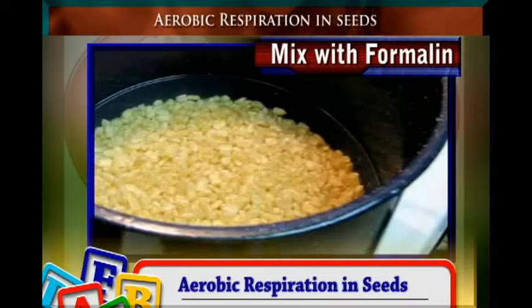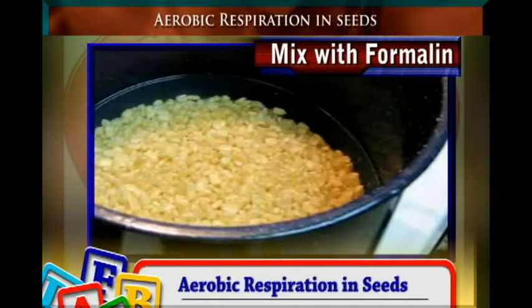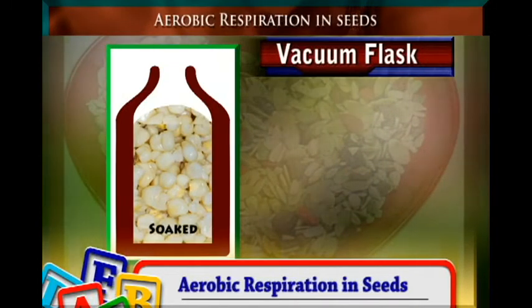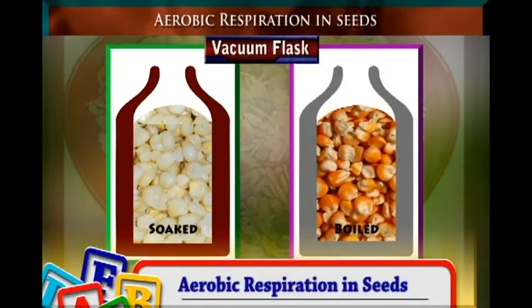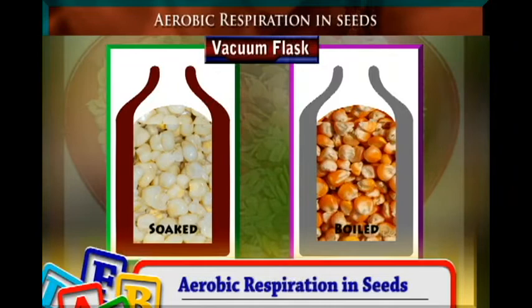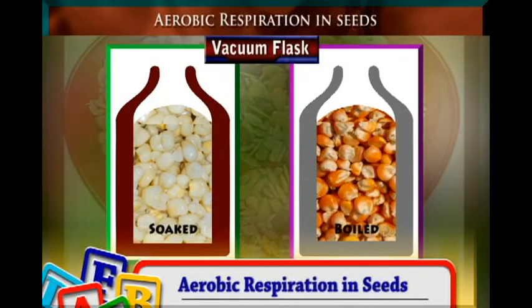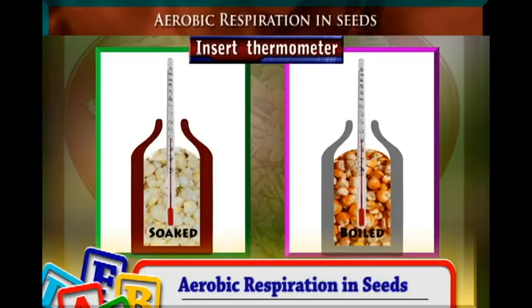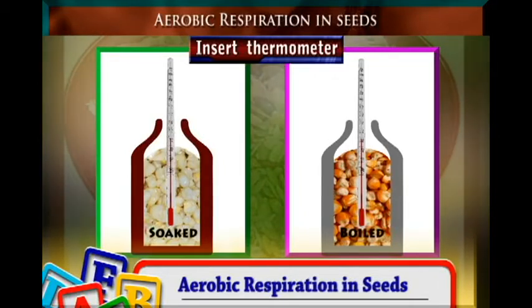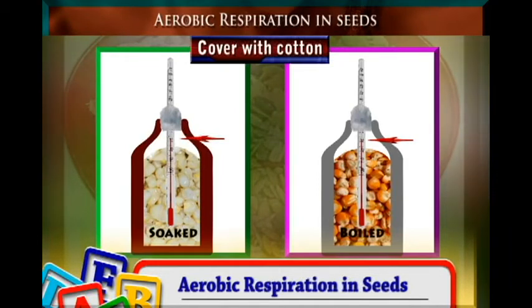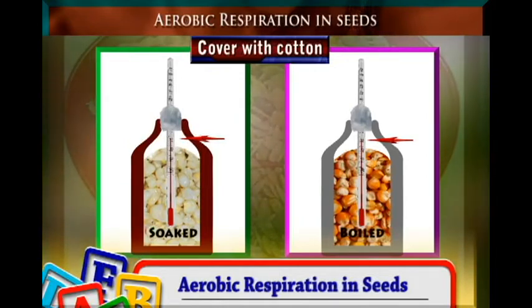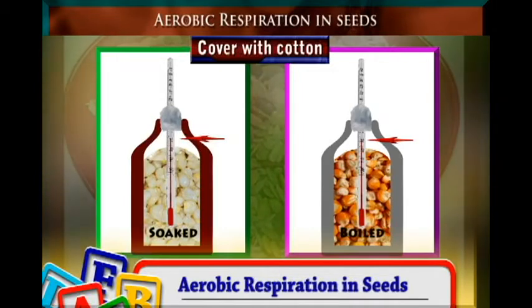Once you have your soaked maize and your boiled and treated maize, get vacuum flasks. Open the lid and pour the soaked maize into one flask and the boiled maize into another. Fill the flasks with the maize, insert a thermometer, and cover the mouth of the flasks with cotton wool.